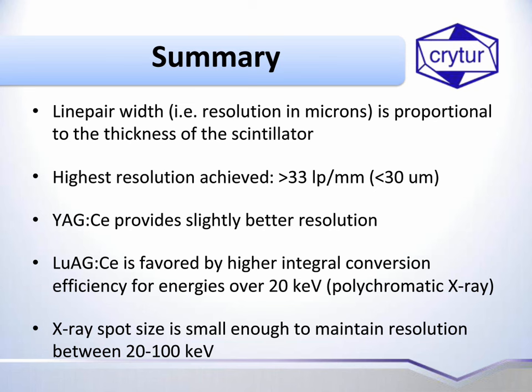The first question I have here is: is the fiber optic permanently coupled to the sCMOS sensor? Sorry, yes, I can probably answer that one. Yes, the fiber is currently bonded to the sensor, but we have actually got modules and capability of putting other fibers on, but the camera has got direct bonded, so yes.